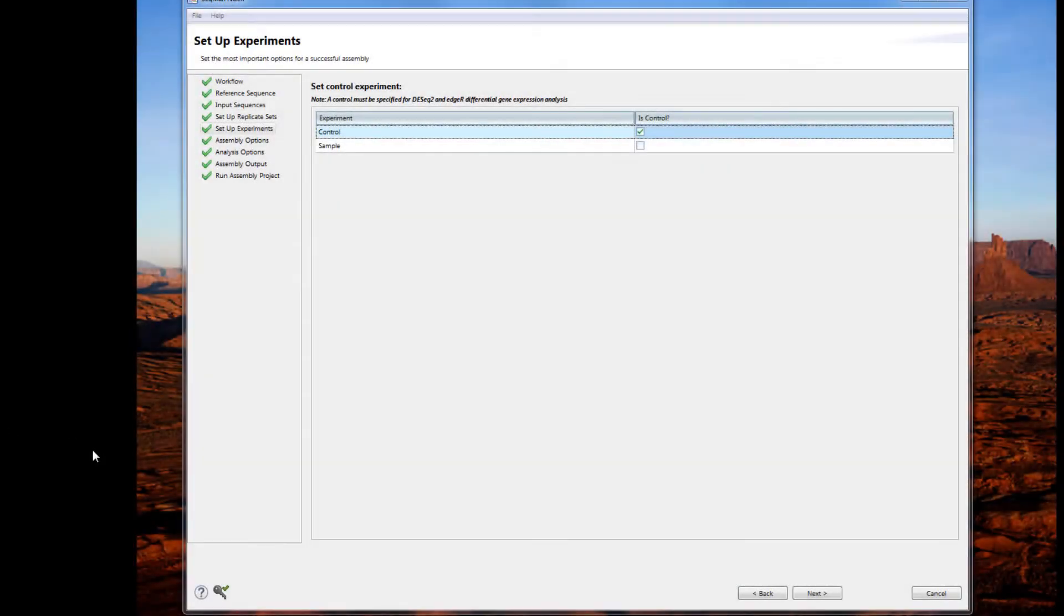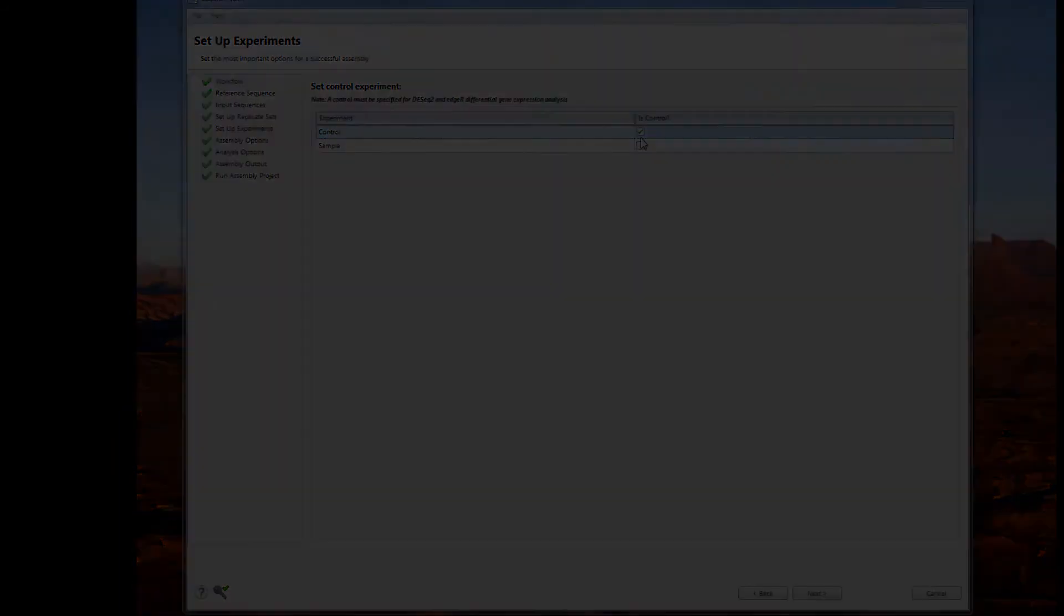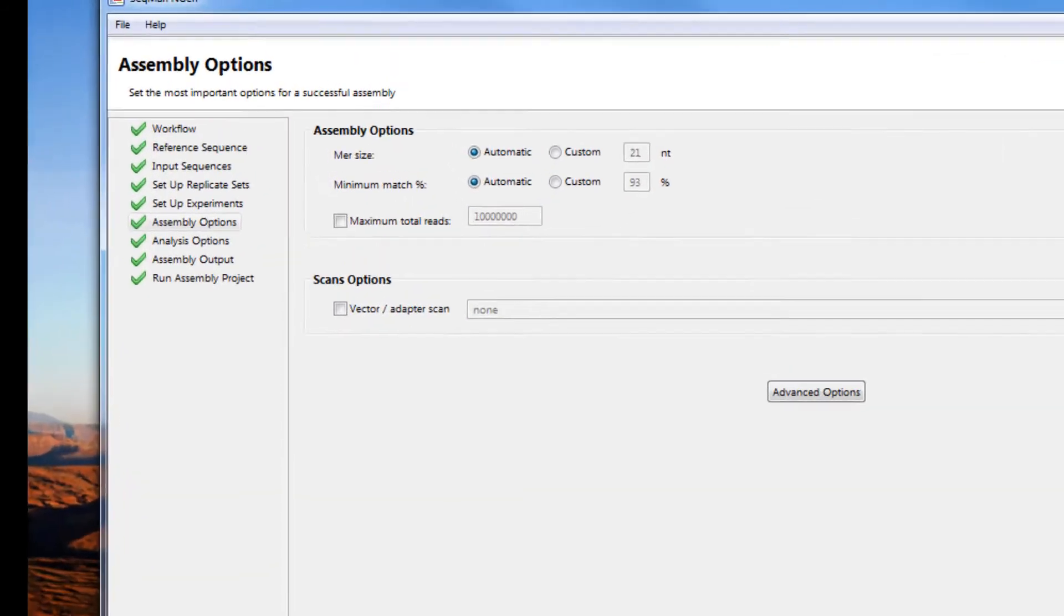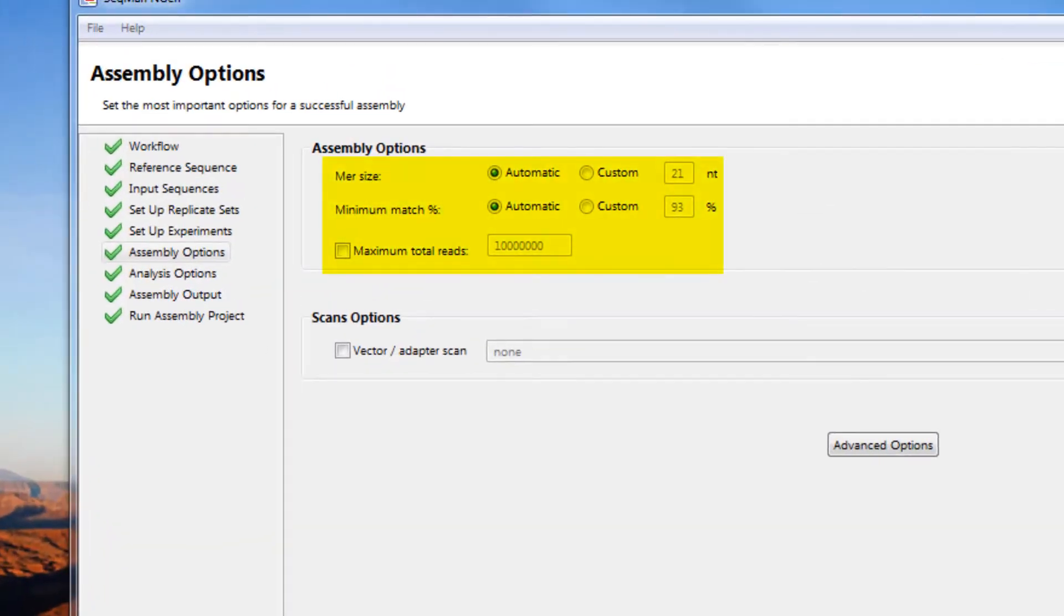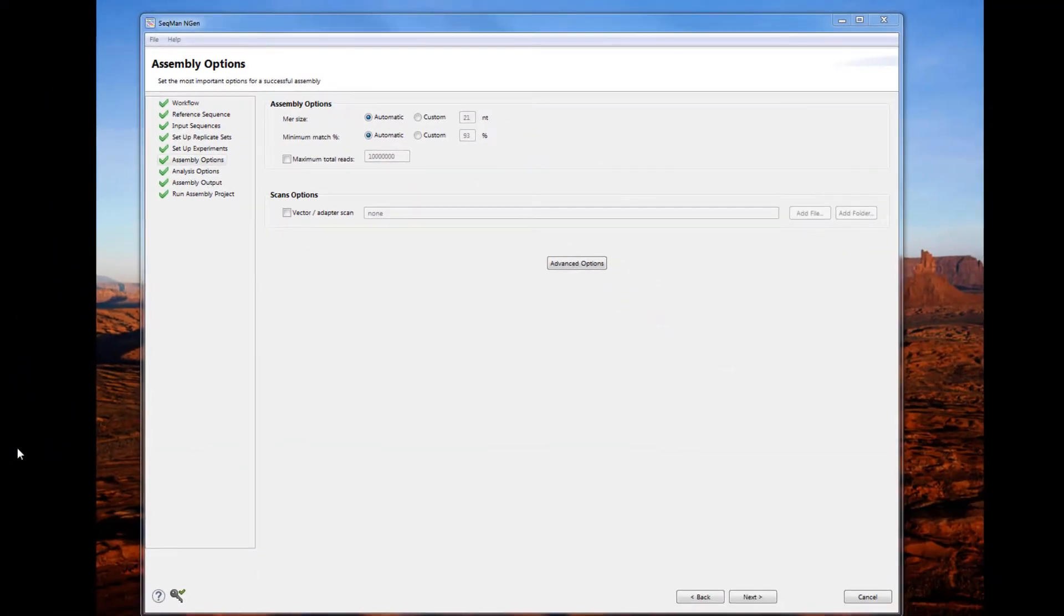In the Setup Experiments page, you can specify the control. You can adjust the assembly option parameters as well as apply an adapter scan if needed. By default, the assembly options are optimized, so there is no need to change the parameters.